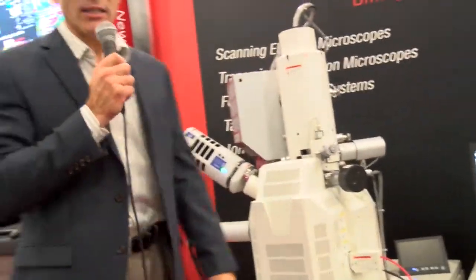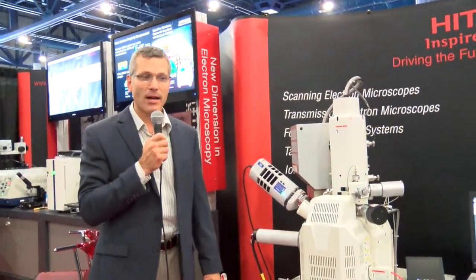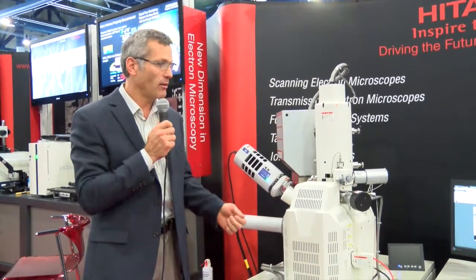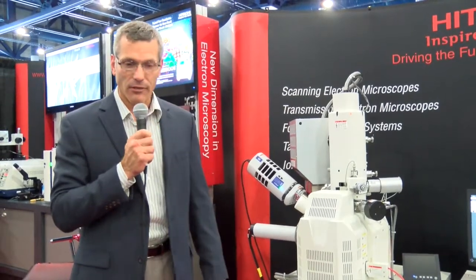We are here at ISFA until Wednesday at booth 119. Please come by — we're open for demonstrations, so bring your samples. We also have several other instruments here including AFM, an ion milling system, as well as our tabletop SEM. Thank you very much.